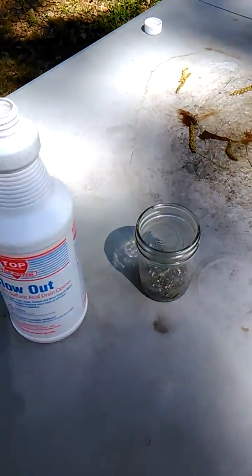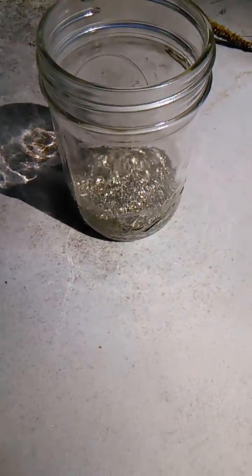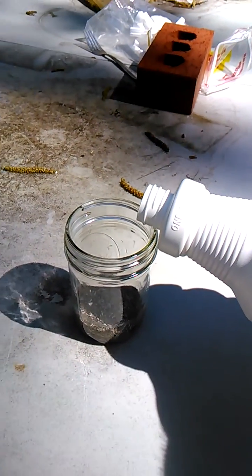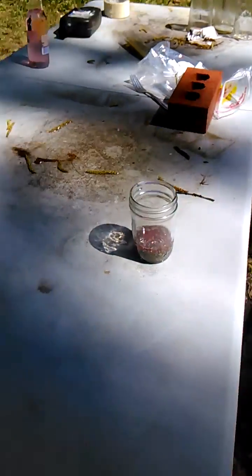What does concentrated sulfuric acid do to iron pyrite? Do not try this at home — for informational purposes only. Let's see what it does. This is concentrated sulfuric acid on the iron pyrite.